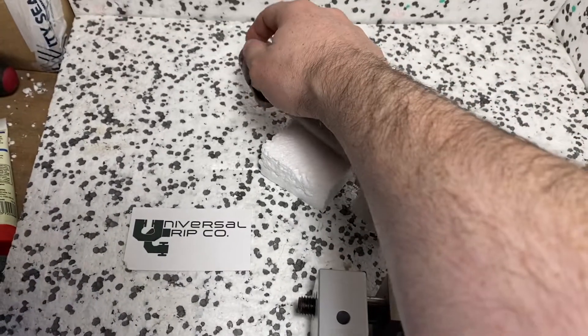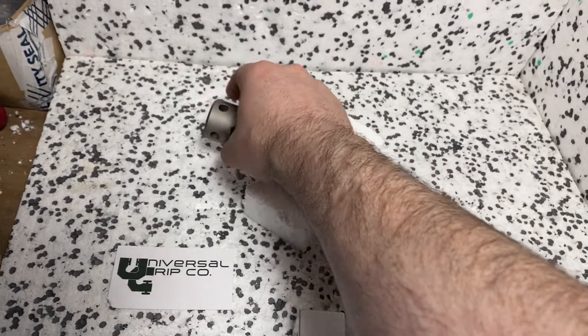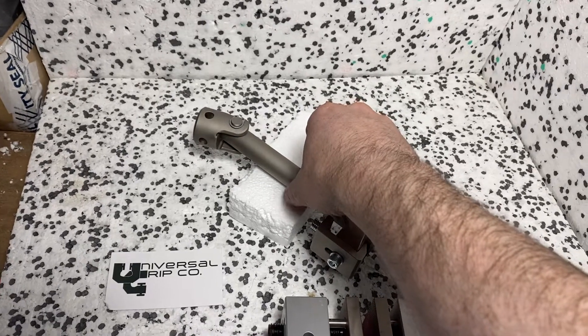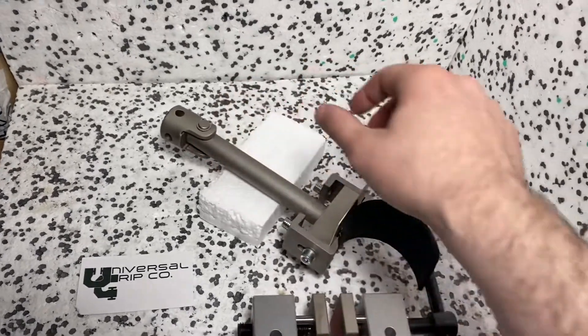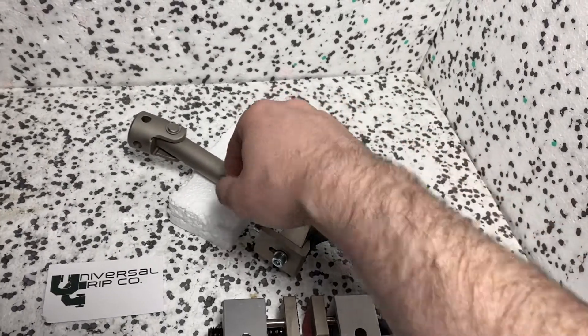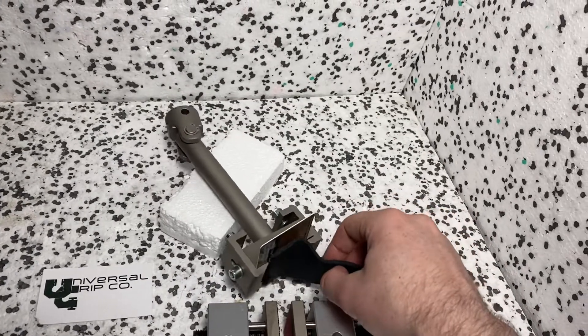You can see it has a single cardan joint here, or swivel joint, which gives it one degree of rotation or flexibility at the joint. As we pull the sample, that's going to cause it to pull back along this joint — that's why it's there.